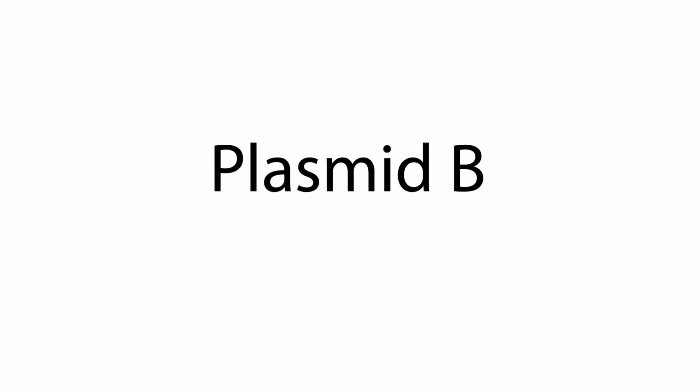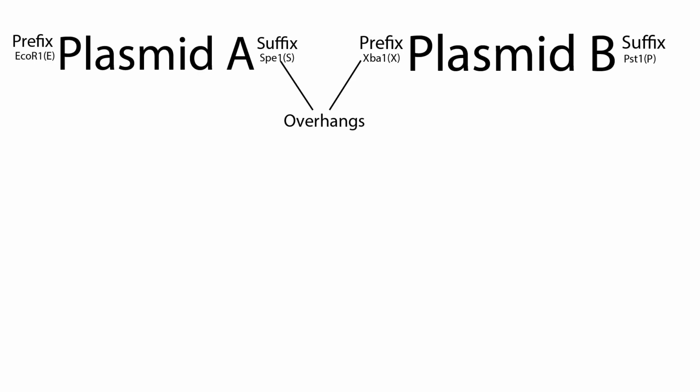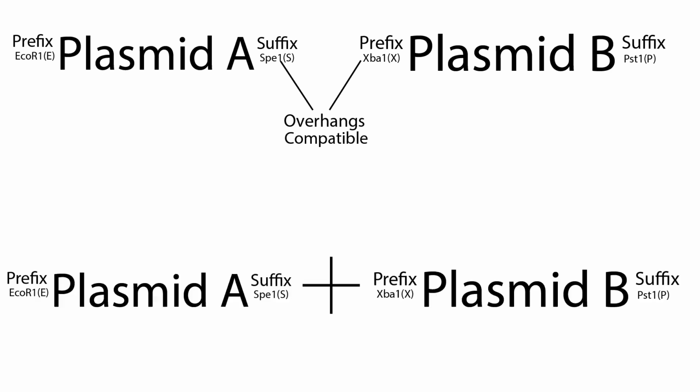Likewise, for plasmid B, we will cut at the XBA1 or X and PST1 or P, the 2 other prefix and suffix sites. The overhangs created by the cuts at X and S are compatible, allowing us to join the S end of plasmid A with the X end of plasmid B.